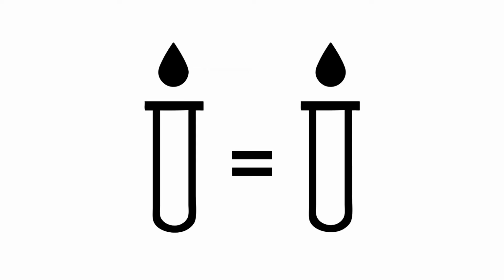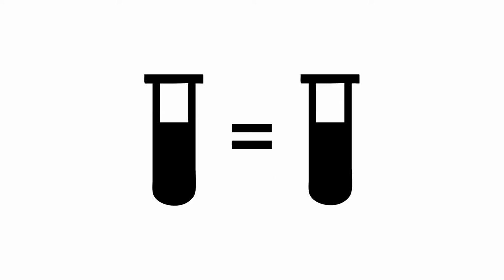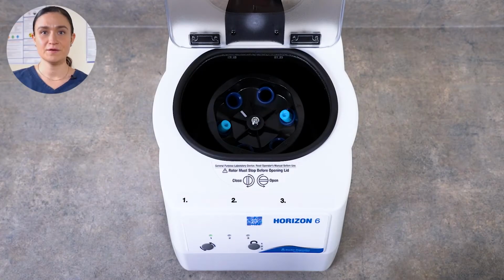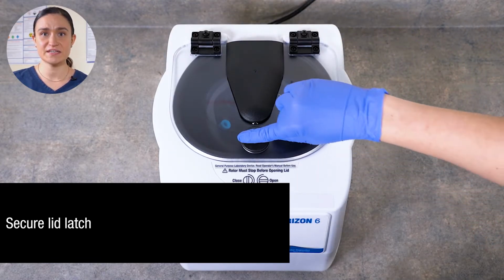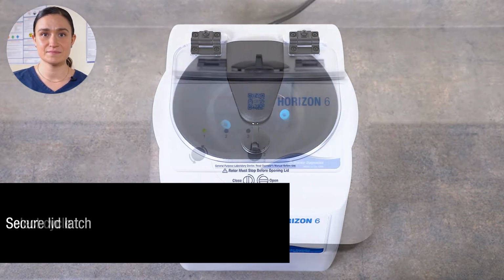Then, get an empty tube of identical size and volume and fill it with water. The counterbalance should be roughly the same weight as your filled tube. Then, place it across from its partner tube. With your tube holders in place and your samples loaded and balanced, you're ready to spin. Close the lid. Secure the lid latch by pressing it down gently and turning it a quarter turn clockwise.